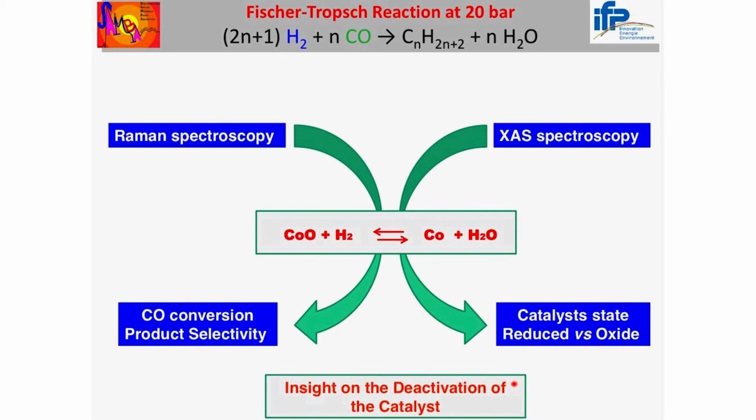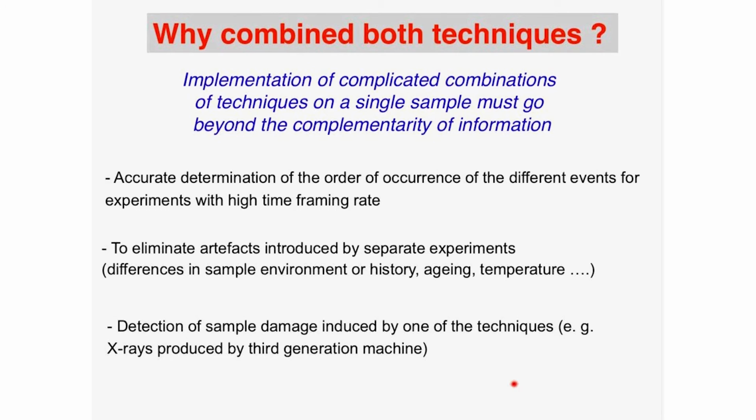So let me finally make a general conclusion about this combination of Raman spectroscopy with X-ray absorption spectroscopy. I hope that you are convinced that such a combination is very powerful for the study of dynamical processes through the complementary information that you can obtain with the two techniques.